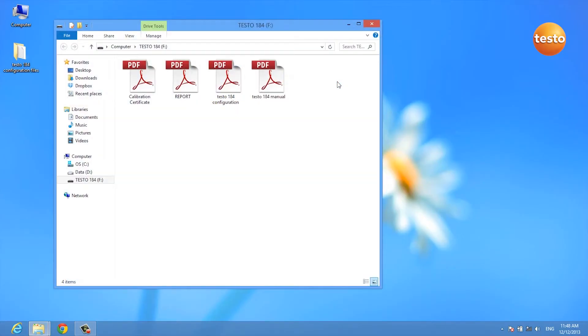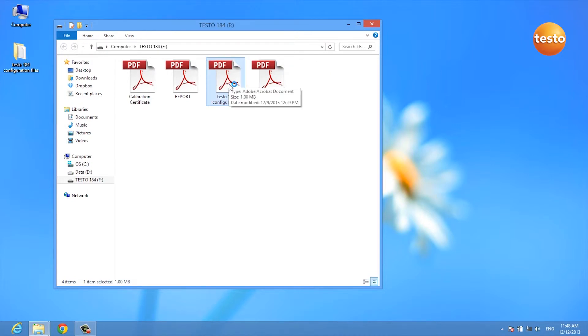After a few seconds, a window opens and we can just simply double-click the configuration file.